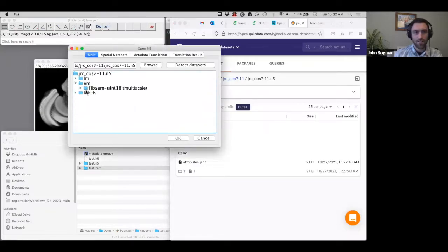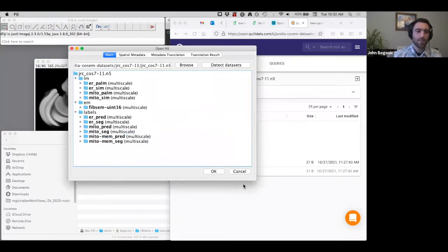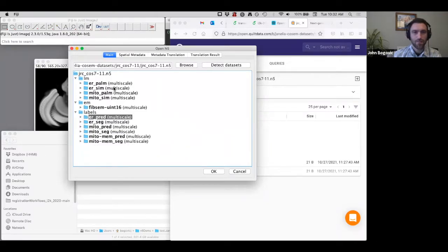And so it finished. It took a little bit of time. This uses multiple threads, so it's a bit faster when I'm not on this laptop, but it's still not super fast. Moby and others have gotten around this in a nice way, but that's at least how this plugin currently works. I guess the point is now that you can see that this has a lot of data sets, many of which are pretty big, so couldn't possibly fit on this laptop. But if using BigDataViewer, I can open them anyway.